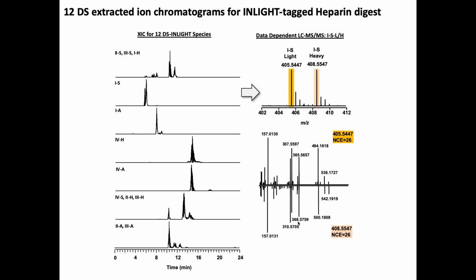All this data is manually interpreted. I did all of this myself, let's put it that way. It took about 6 months between doing a lot of other stuff. Just sit there and go through, manually extract all the data, interpret the MS-MS, and validate what I think is real and not. And that doesn't account for even the oligos.